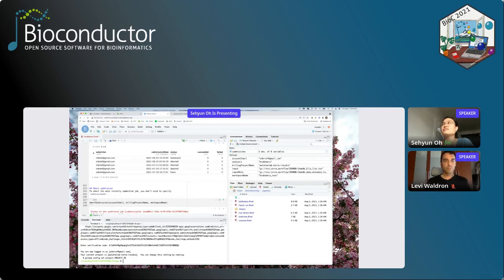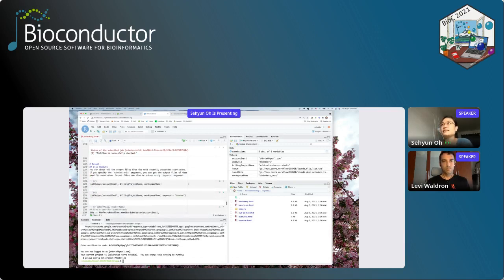I tested a bunch, so I did abort and submit, but there's one workflow that succeeded in the past, and it will grab that unless you specify which submission you want to check. It will pick up the most recent successful one.